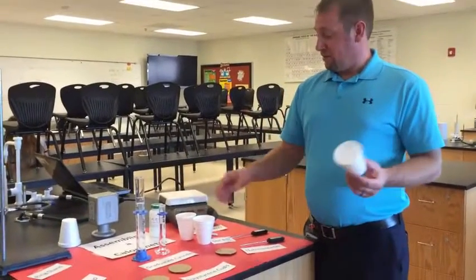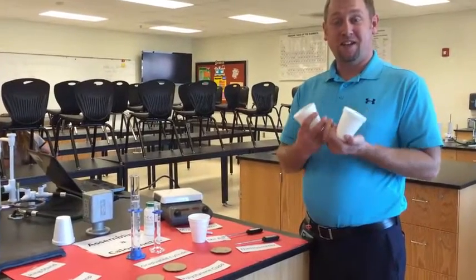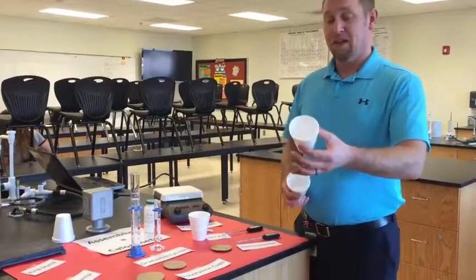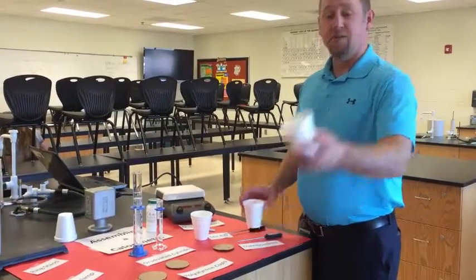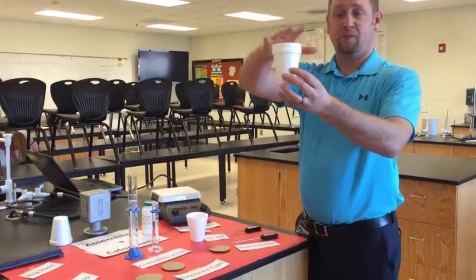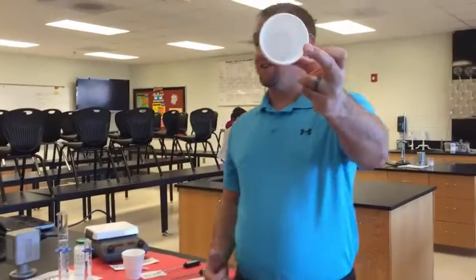A calorimeter is a really simple device, such as a foam cup, that keeps the heat in because we want to measure how much heat is produced in this reaction. So what we're going to do is take two foam cups for a layer of double insulation and put them together like so. The reaction is going to happen inside the foam cup.